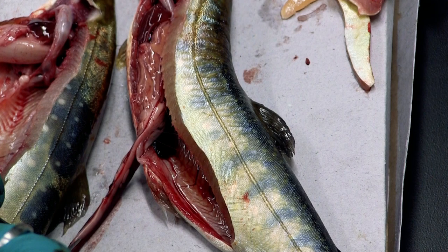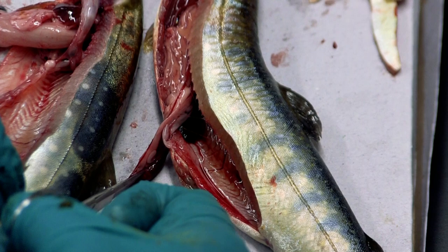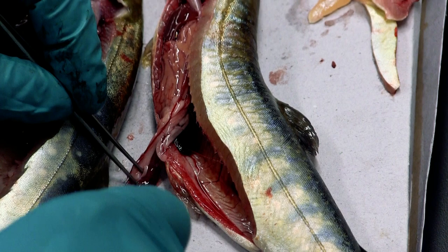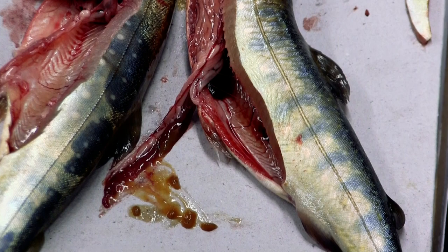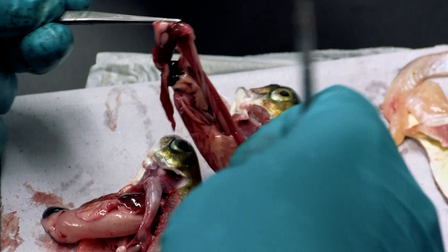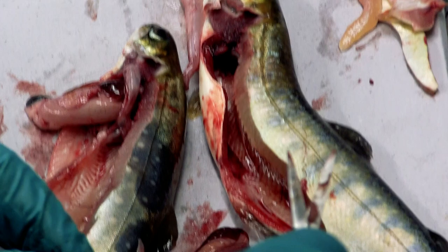I've seen quite a bit of variation even within groups, so it's sometimes hard to make a diagnosis based on that alone. But we might scrape some of that material out — there's a bit of digested food, a bit of mucus — and look to see if there are parasites. This is a great site to collect samples, put on a slide, and examine under a microscope.